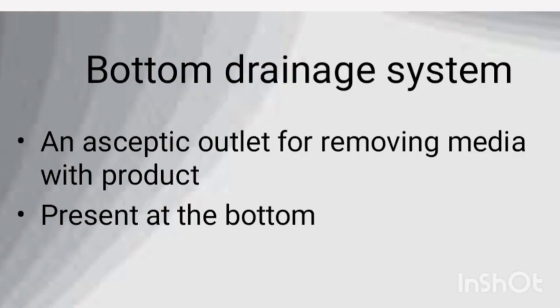Next is the bottom drainage system. It is an aseptic outlet. It is present at the bottom of a fermenter and it is for the removal of the media with the product formed. The media with the product requires additional procedures like purification and other procedures.